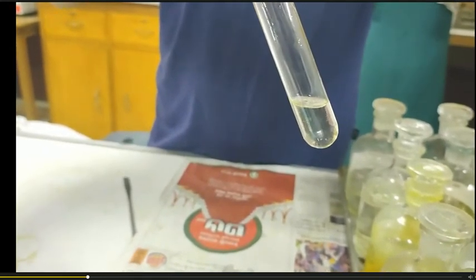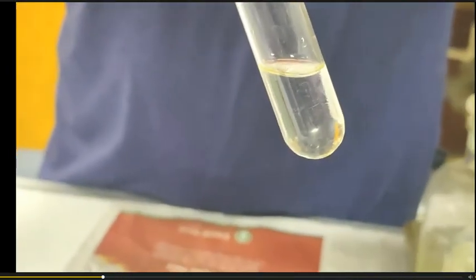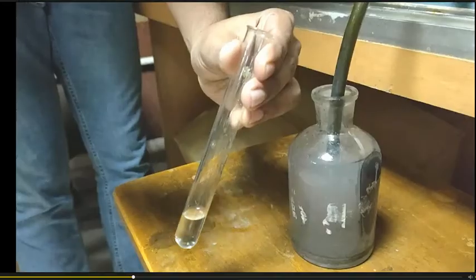There is no PPT. This indicates that there is no group 1 cation. Now we are going to apply hydrogen sulfide gas into this test tube.